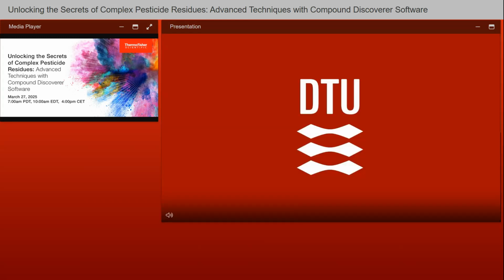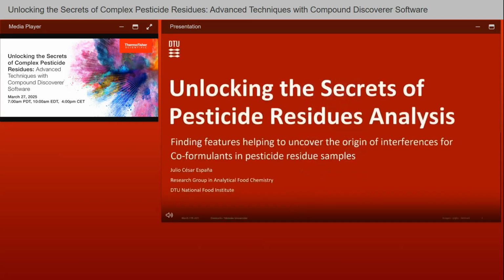Thank you for the nice presentation. Today, we are going to dive into the analysis of pesticide residues, and we will take a look into other molecules present in plant protection products. This is a subject that's also relevant for food safety. By the end of the session, we will walk away with some useful information from the research group in analytical food chemistry at DTU.